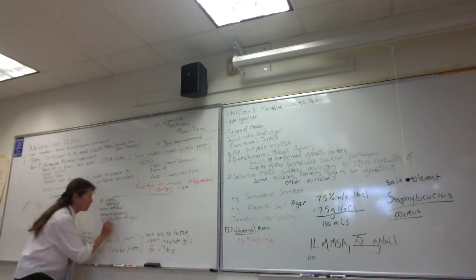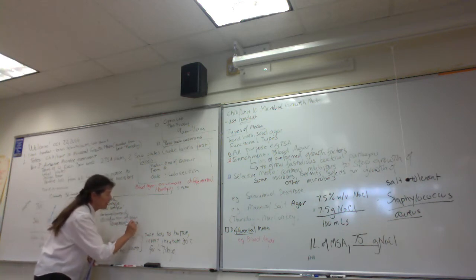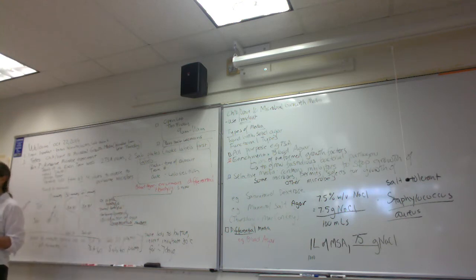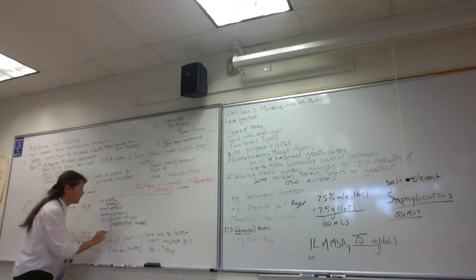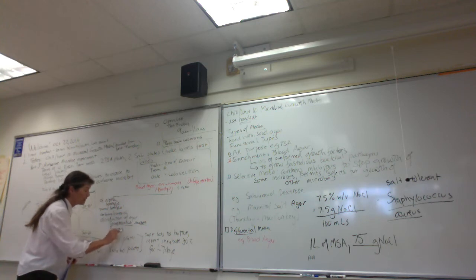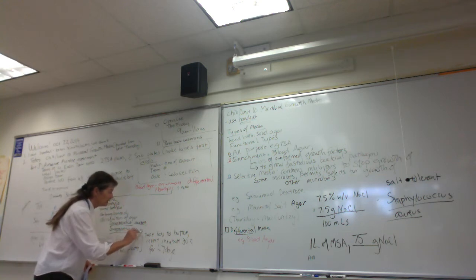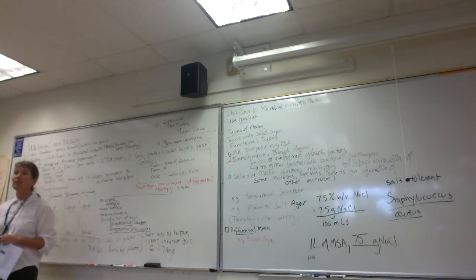So this is why, you guys, if you do a throat swab, or you collect saliva, or if you were to swab your gums, and then transfer your specimen to blood agar and incubate it, you're going to get nice alpha hemolysis, yeah? A second pathogen I'd like you to know is another member of the genus Streptococcus, and this is Streptococcus pneumoniae. What do you think Streptococcus pneumoniae causes? Yeah, pneumonia, right? This can be really serious in older folks, right? And in some cases, it can invade the bloodstream and even invade the central nervous system. So again, in your older patients, Streptococcus pneumoniae can be a really serious pathogen.